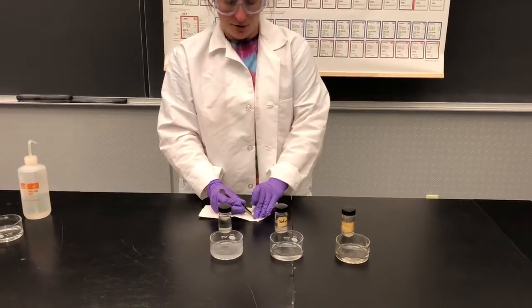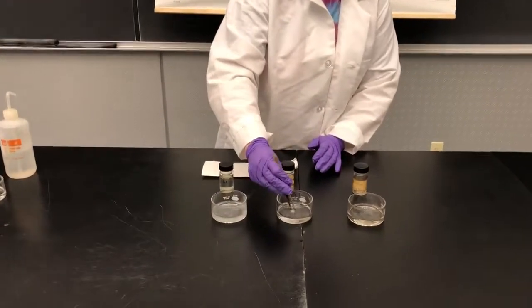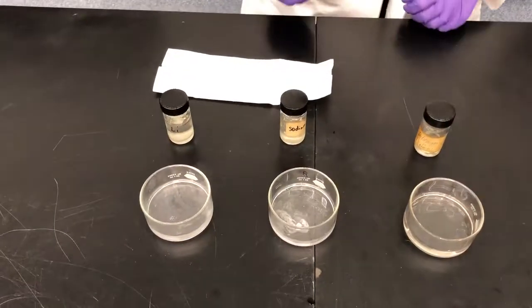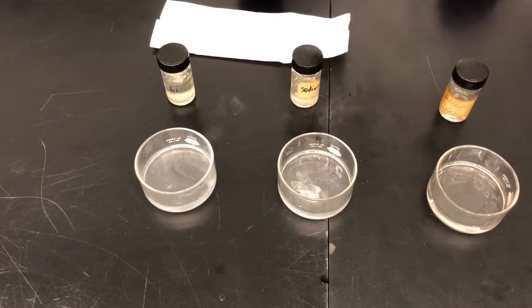Now with the pure sodium — watch what happens as that ball rolls around, which by the way was not spherical when I first put it in there.